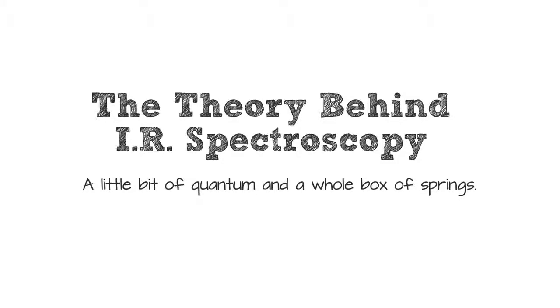Welcome to an introduction to the theory behind IR spectroscopy. We're going to see that IR spectroscopy takes advantage of a quantum regime that involves vibrational quantum levels. We'll recall that UV spectroscopy is actually the promotion of electrons from one electronic energy level to another. So you're moving from one orbital of a certain energy to another orbital of a certain energy. But in IR spectroscopy, we are dealing with the spaces between those lines, the vibrational quantum energy levels.